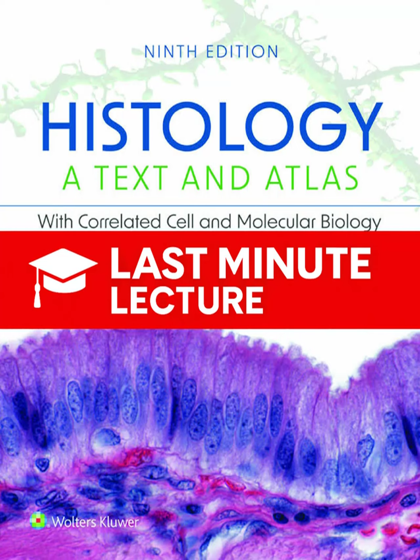It makes sense. But if it's the gold standard, there have to be some limitations, right? Something it's not good at. There is one major limitation, and every histologist has to know this. Formalin is poor at fixing lipids. Okay, so fats. Right. Cell membranes, neutral lipids, they're just not well preserved. And then the next steps in the process make that problem even worse. Because when you introduce organic solvents, those lipids often just dissolve and are lost completely. Which leads us right to that next phase, embedding and sectioning.